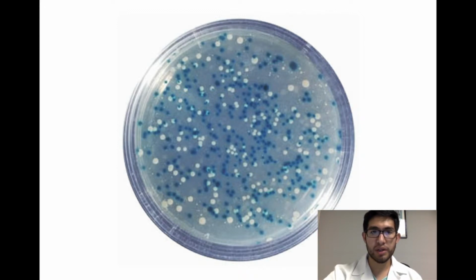In order to differentiate the colonies that have the vector with the insert, a selection is made by X-gal. This selection is possible due to the alteration of the ORF of the gene that codes for the beta-galactosidase. As the information of this gene is interrupted by the insert in the plasmid, the bacterium is no longer able to synthesize the beta-galactosidase, which degrades the compound X-gal producing metabolites with blue coloration. Therefore, the colonies that present the insert inside the plasmid will be white. To verify that the colonies have the insert, protocols can be performed such as those mentioned: blue-white coloration, PCR, or even using restriction enzymes.